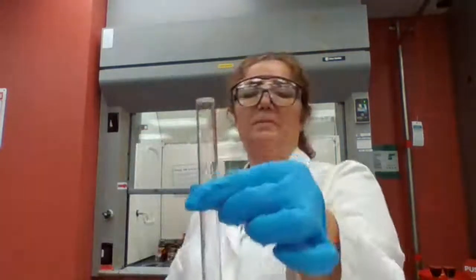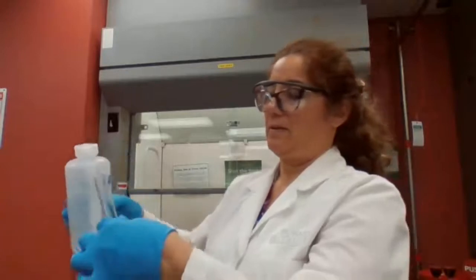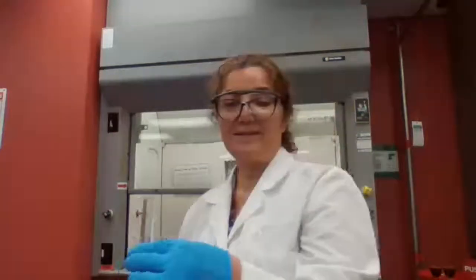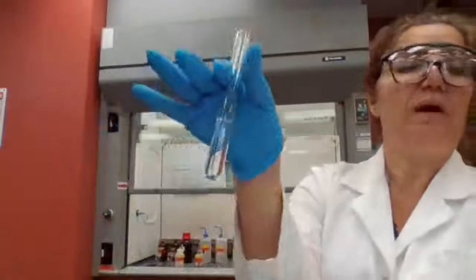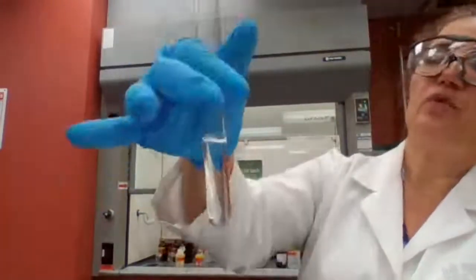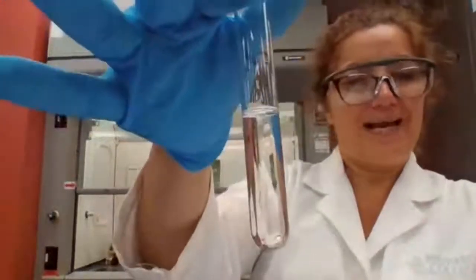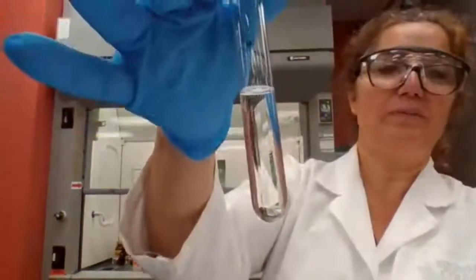5 drops of the amine, and I added water. The amine that I'm using is sec-butylamine, an amine with 4 carbons, completely dissolved in water. This is a good example for amines that have less than 5 carbons, they dissolve in water.